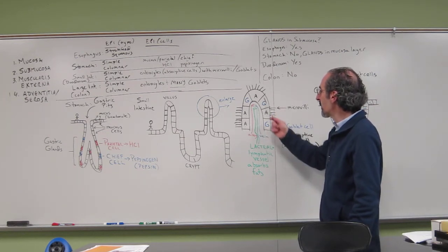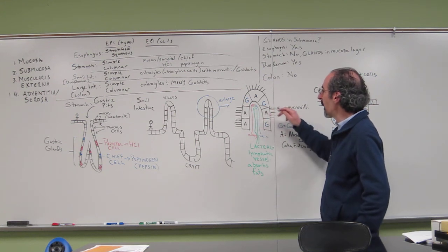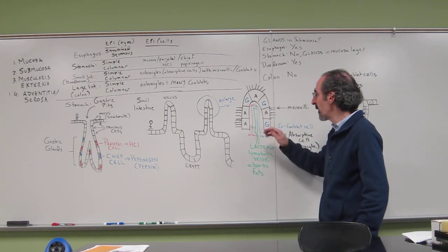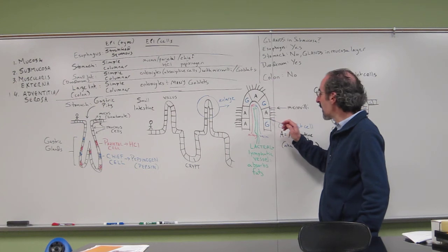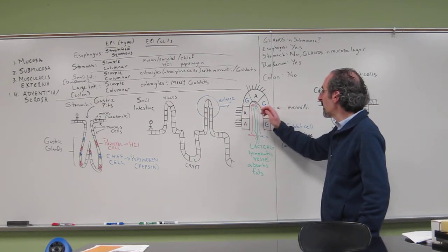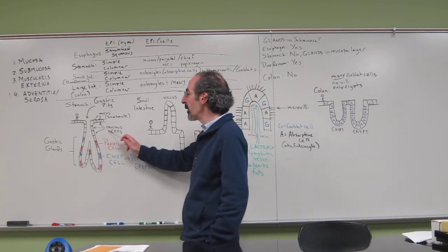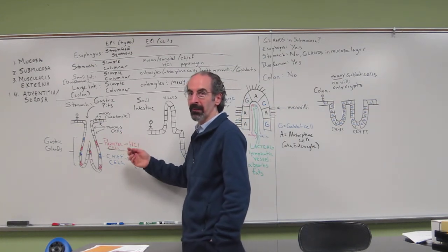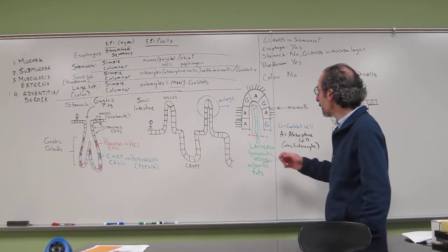Here I've enlarged just the tip of a villus, and the cells that make up the epithelium of the villus are really two kinds of cells we want you to appreciate. First of all, you will find that there are goblet cells, and the goblet cells will be secreting mucus, just like the goblet cells do in the trachea. The goblet cells here in the small intestine are really a replacement of the mucus cells here, which also secrete mucus. They're essentially secreting similar substances, watery-based fluid.